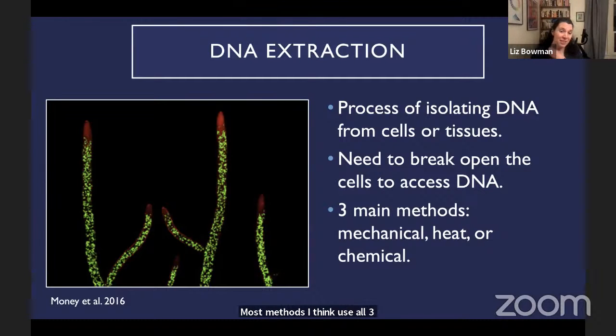I use a really simple method for extraction. It takes like 10 minutes and uses 2 different solutions, but it uses all 3. And that's the best way to do it.